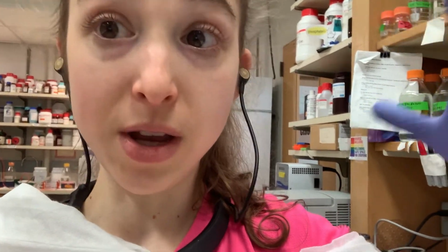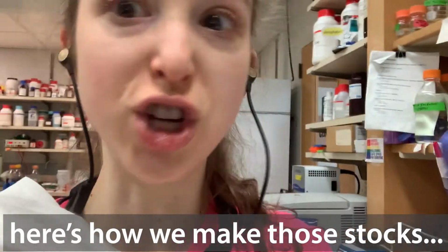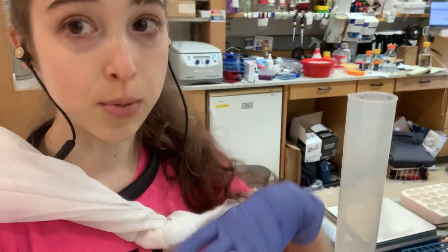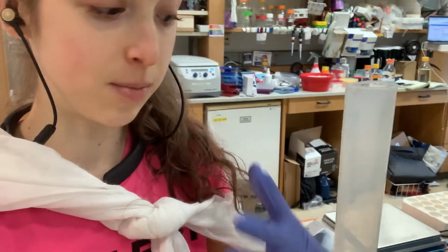By making these stock solutions, we can more easily make the buffers that we want for our proteins, like our working buffers, as opposed to the stock solution. We tend to call any solution that has a buffer in it a buffer, even if it's not just the buffer. So it's really important that when you're preparing your buffer, you leave room to adjust the pH.